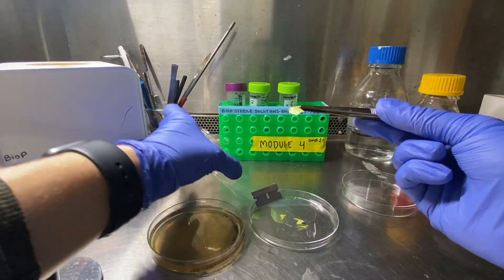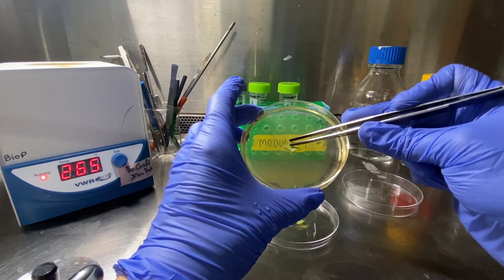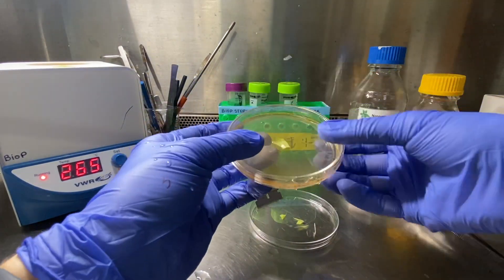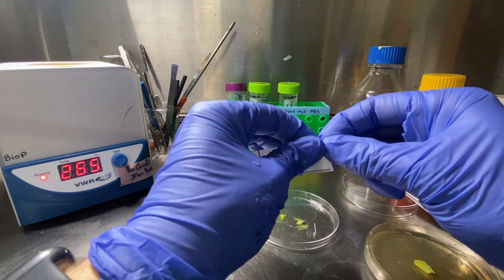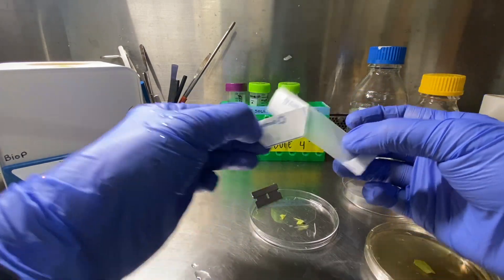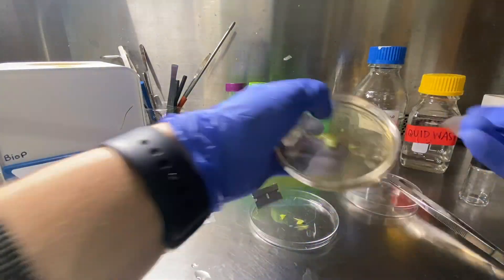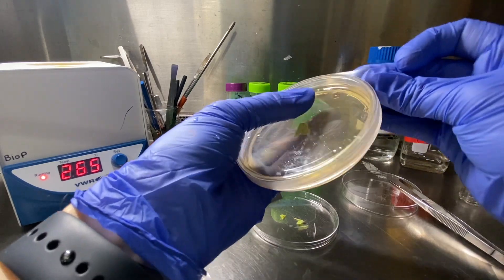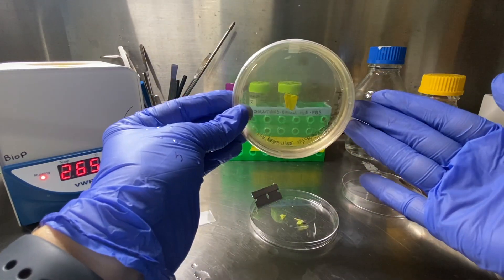Once you have completed that step and have fresh edges all around, go ahead and place the leaf onto your media of choice. Make sure it is firmly pressed against the media. Cover it and wrap it with some parafilm. If you have trouble getting the wax paper off, I like to rip it a little bit — it helps get a grip when you have gloves on. Then you are ready to set it in the incubator for 24 to 48 hours.